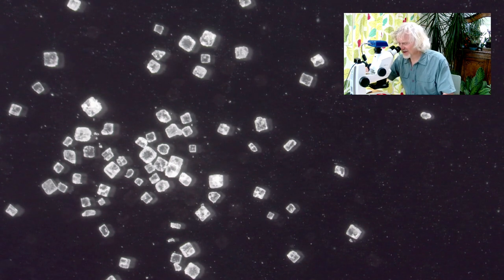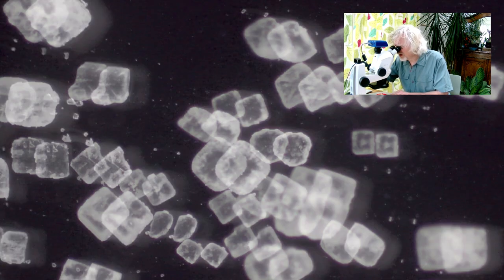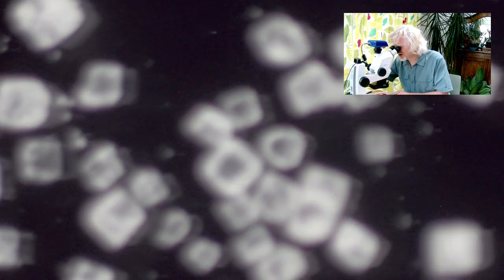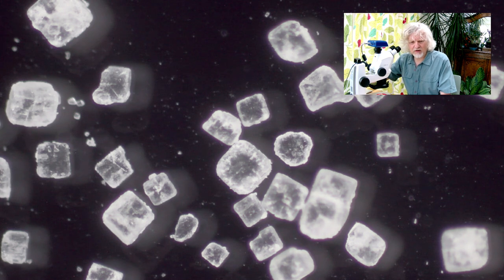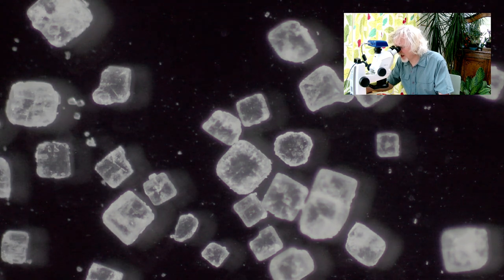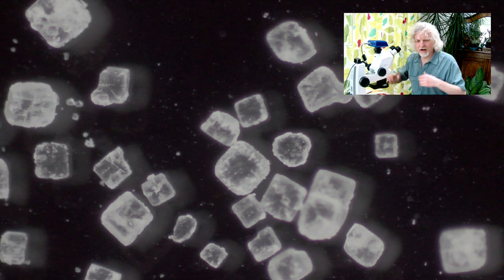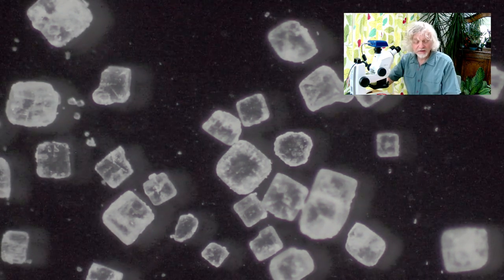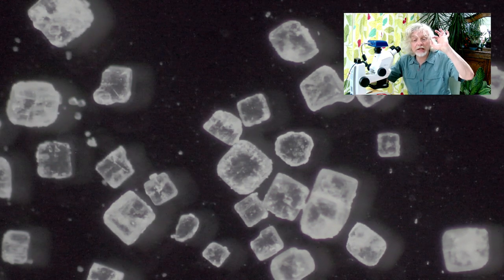It's rather lovely, isn't it? There's lots of little tiny blocks. Let's zoom in a little bit because it is jolly small. And get the focus right on. And that is salt underneath. I'm actually going to turn the brightness down a little bit because I'm getting a little bit of glare. So this is what salt looks like under the microscope. It's literally lots of tiny little cubes.